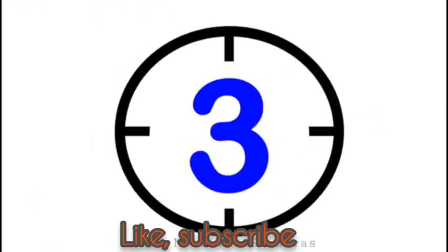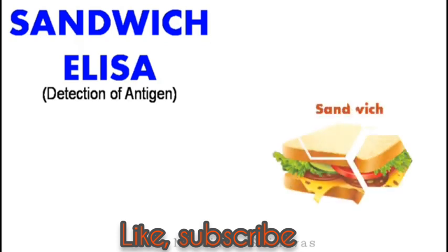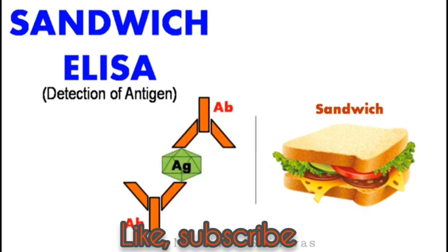Next. Number 3. Sandwich ELISA. Used for the detection of antigen. You know the word sandwich means the vegetables stuffed between two bread slices. So, in sandwich ELISA, the name suggests that here the antigen is sandwiched between two antibodies.